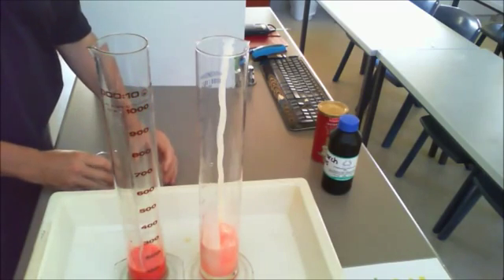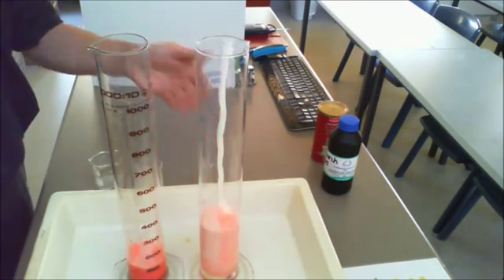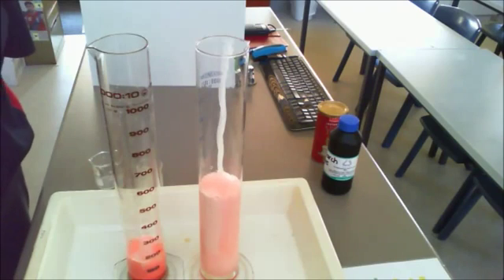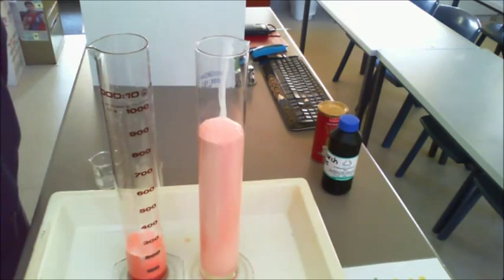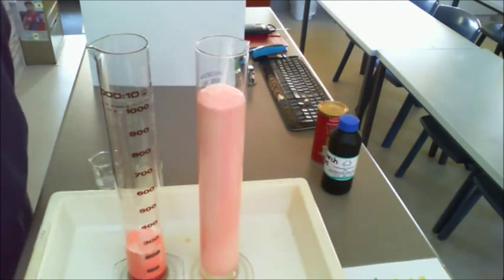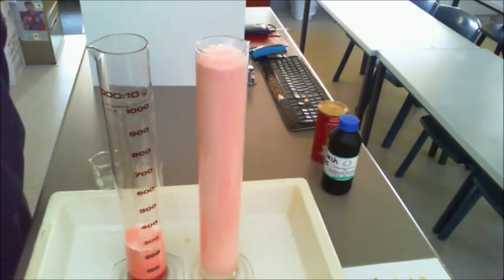Now you can see straight away that in this one we have an increase in the amount of gas being produced, and this particular reaction is what's commonly known as elephant's toothpaste, which is a fairly common one. On this side the bubbles are now starting to be produced, but obviously this one is occurring a lot quicker. It's about to come up and over the top.